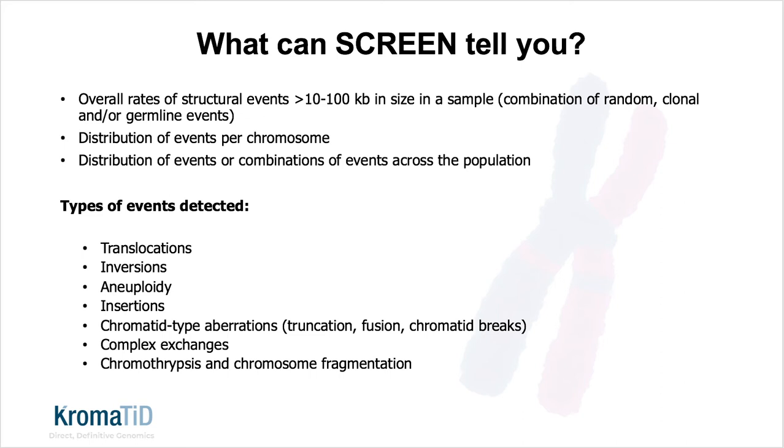Highly unstable samples can be flagged, and samples that are karyotypically changing over time due to selective growth advantages or transformation can be identified. The whole genome can be screened for previously undetected constitutional variants that could be present in the background of an editing system or even present in a rare disease patient as the subject of study. SCREEN can be used to investigate confounding sequencing results or low confidence calls, which often present themselves when analyzing structural variants greater than 500 BP with NGS.